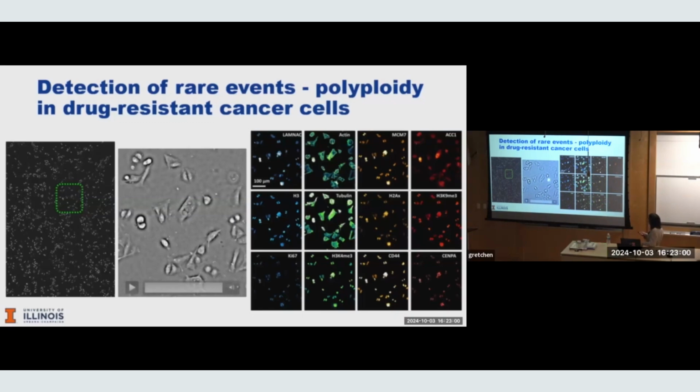So you see another one. It's intentionally shown because this is another multi-nuclei or polyploid cell. They all have a very high level of stemness and a high level of DNA damage. That's probably why they get sort of hidden inside, as a protection of themselves, and a high level of metabolism and proliferation.